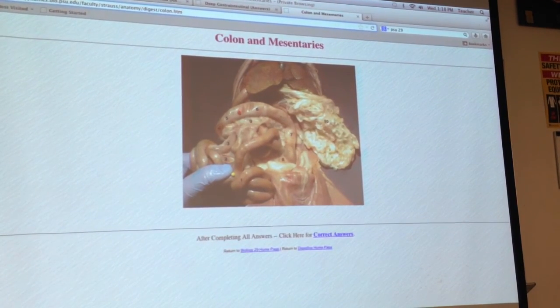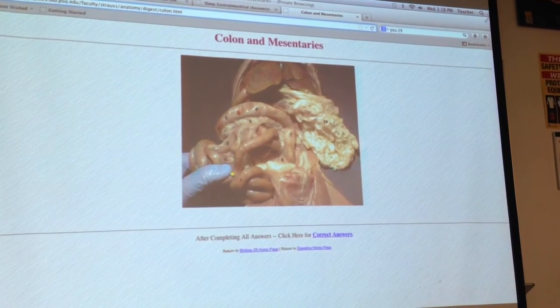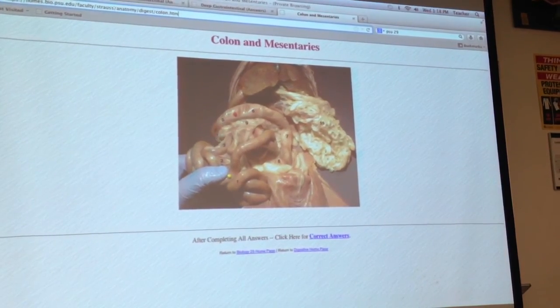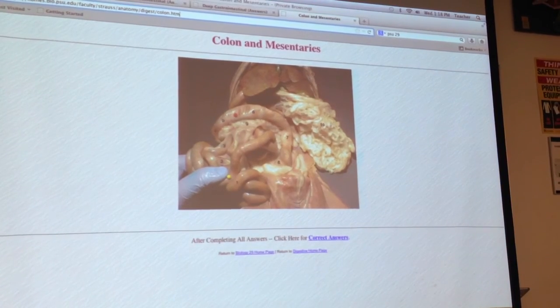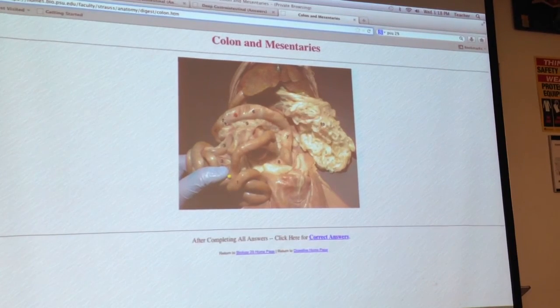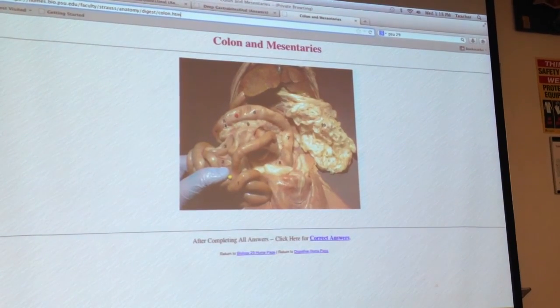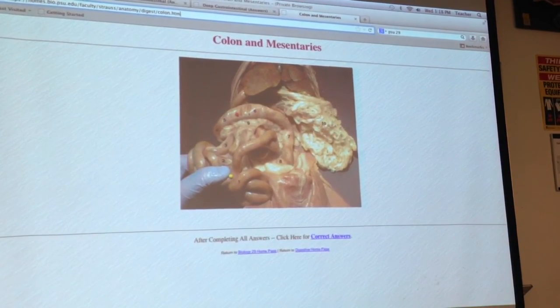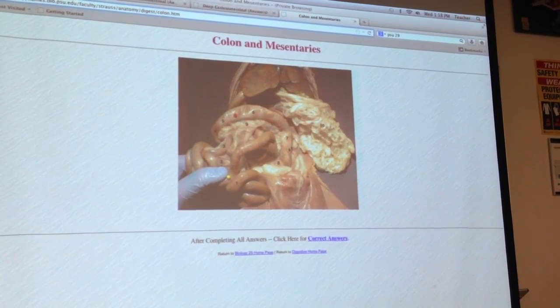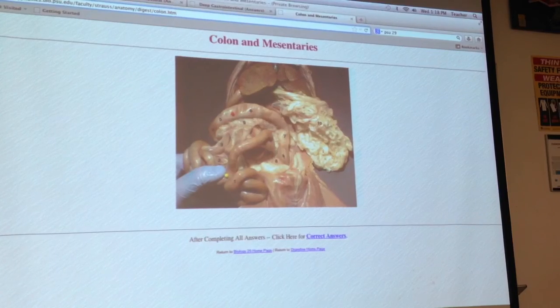Especially if it's not going to be perfectly in line in the cat's abdominal cavity. So if I were explaining this or showing this to you, I would call all of this the transverse colon, okay? Just because there's such a small part of that ascending colon that it's really not even worth mentioning. So I would just say all transverse colon. And then again, see it dropping down, this would be where it's the descending colon.